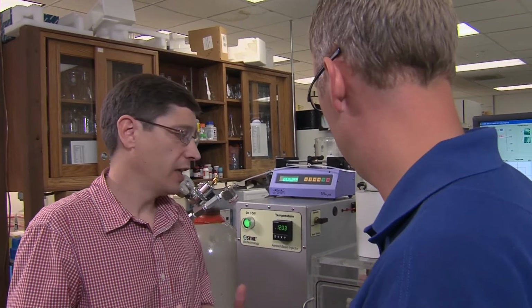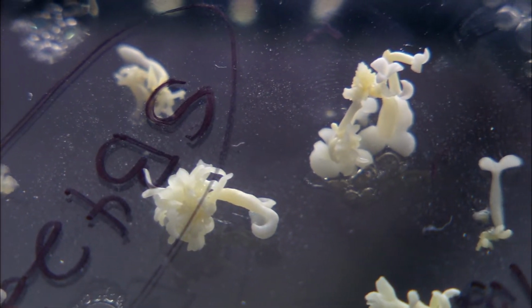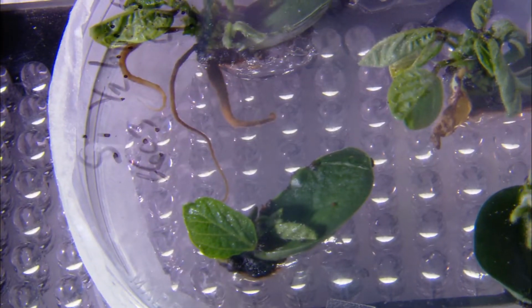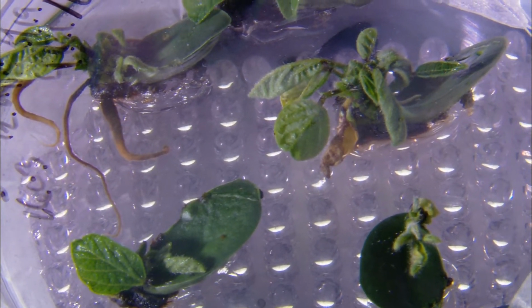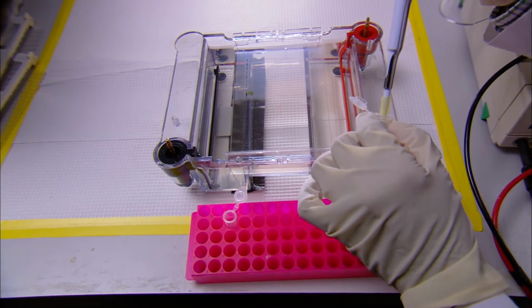Now, how long does that take? Well, this process here just takes a minute or two, and it's really short compared to the entire process of actually getting the DNA into the cell and then selecting a cell with the DNA in it and regenerating a plant from that single cell. And that whole process can take 6 months to over a year. Really? Okay, so it's not an overnight process. No, it's not. What kind of plant tissue do you use then to insert the trait into? Well, we use a soybean embryogenic callus and corn immature embryos.